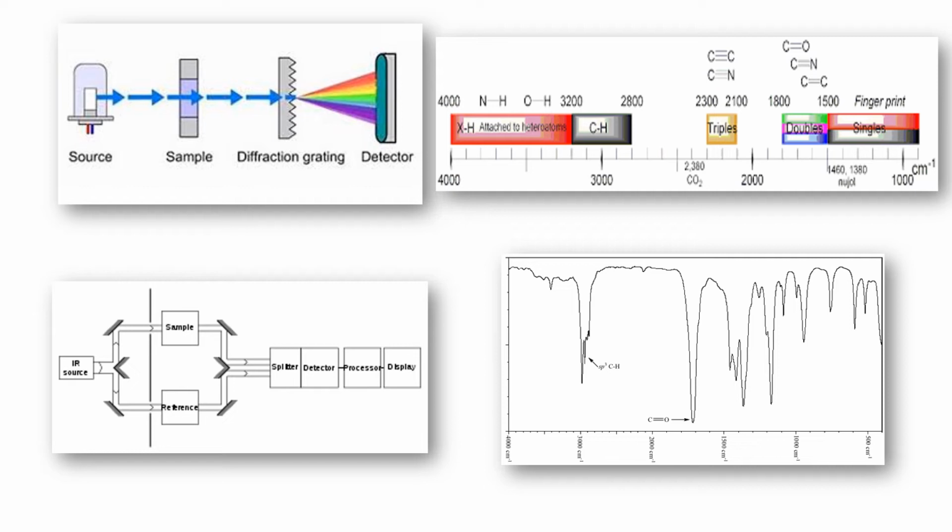These are the standard vibrations of the molecule. The fingerprint region is below 1500 cm power minus 1 in the absorption spectra, where the fingerprint of the molecular vibration is possible. Below 400 cannot be detected, but the IR spectral range is 400 to 4000 cm power minus 1.